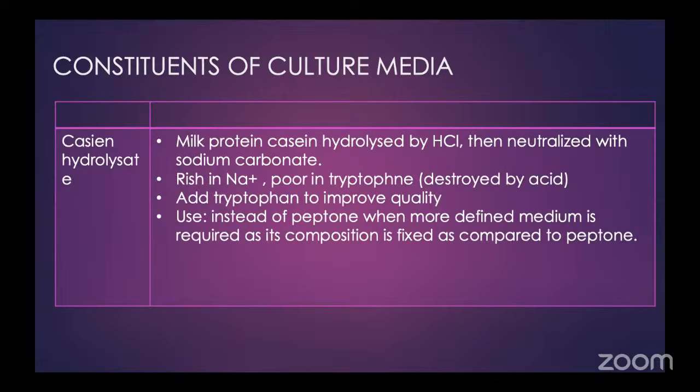So what we do is hydrolyze the milk with HCl and then neutralize it with sodium carbonate. So what happens? What are we essentially making? You remember the making of paneer at home? You add vinegar, which is an acid. That is exactly what is being done: you add HCl, and then you neutralize that HCl with sodium carbonate.